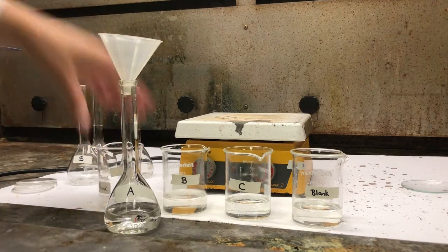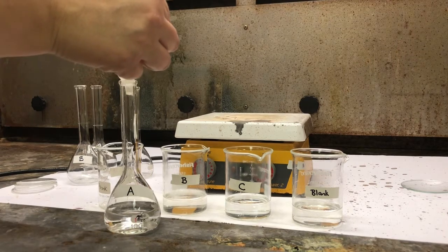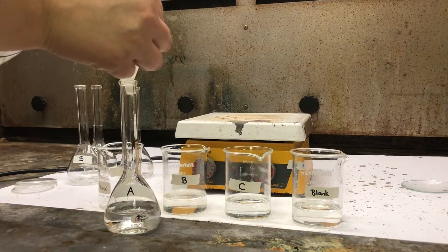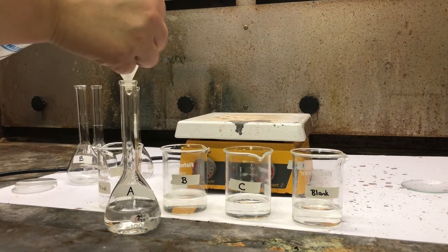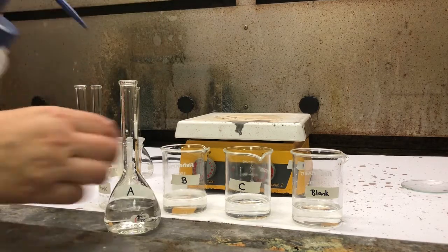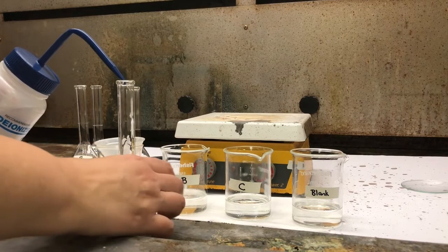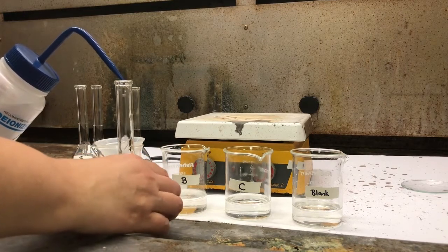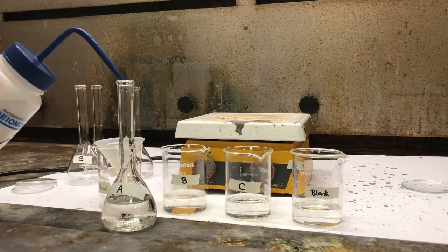Do the same thing and rinse down our funnel, so if there's any sample left in the funnel, it will go down into our solution. Rinse down the neck of the volumetric. I'm not touching the tip of the water bottle to the flask because I don't want to contaminate it.